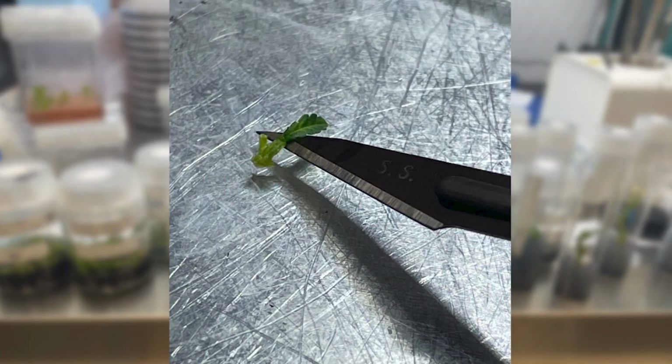I work in the tissue culture industry, for one of the largest producers of cannabis in the state. Part of my job on a day-to-day basis is selecting a donor plant, which is just a mother plant or a stock plant that we want to initiate. We take small cuttings from this plant, usually nodal segments and meristems. Your nodal segments are anything from a leaf to a branch point, and your apical meristem is anything that is a growth point. So you have shoot apical meristems and root apical meristems. I mainly work with shoot apical meristems because they are the most vigorous and the easiest to work with.